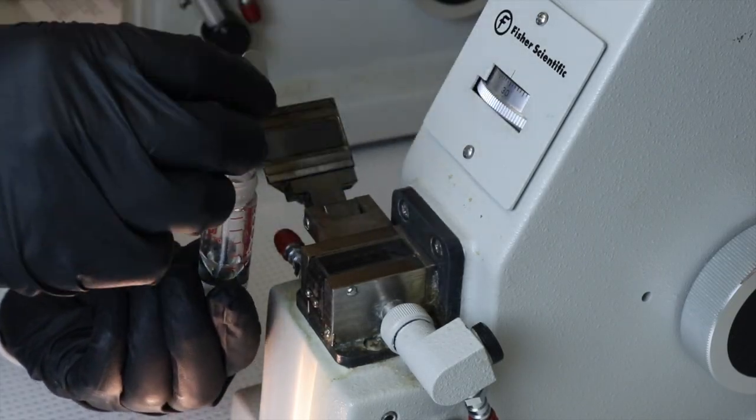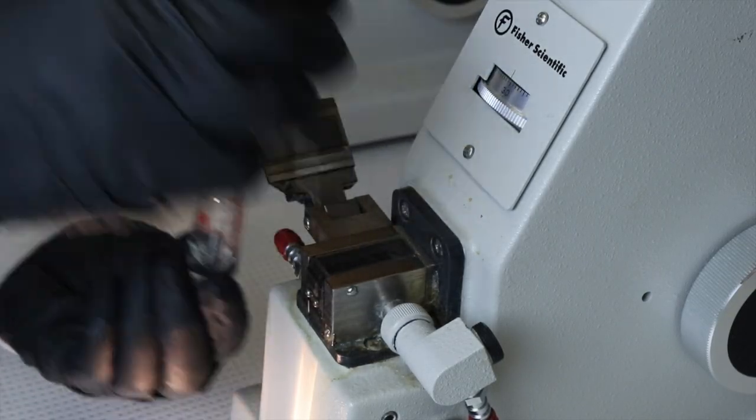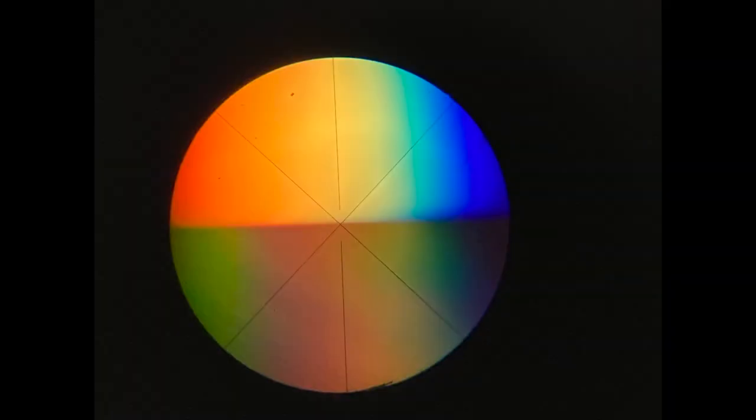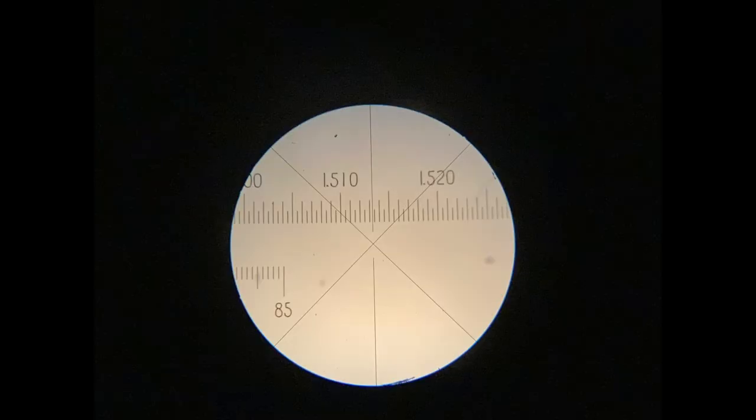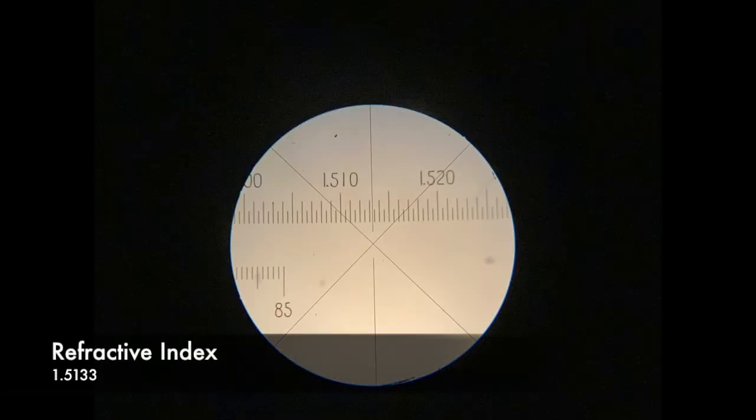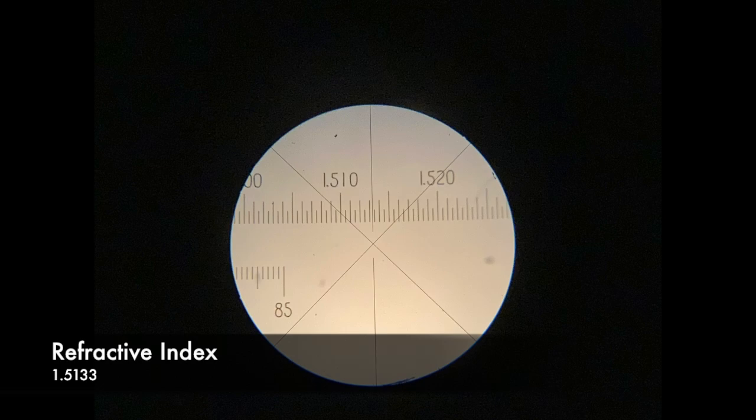Finally, I'll measure the refractive index, so I'll place some of the product onto these crystals. And then looking through, I'll place the line separating the light and dark hemispheres right through the crosshairs, and look at the index given. It's a little higher than literature value, but it's still pretty dang close.